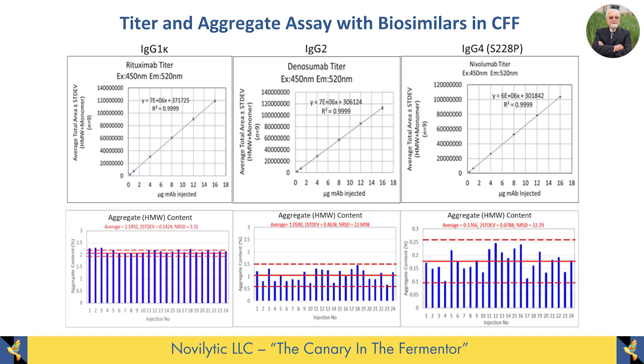As you go down in concentration, of course, the variation in the assay increases. But you can see that the percentage of this dimer that you have is very small out of the total. It's 1/10%, 0.2%. As you go to lower and lower concentration, you would expect more variation in the assay, but that's very little variation.